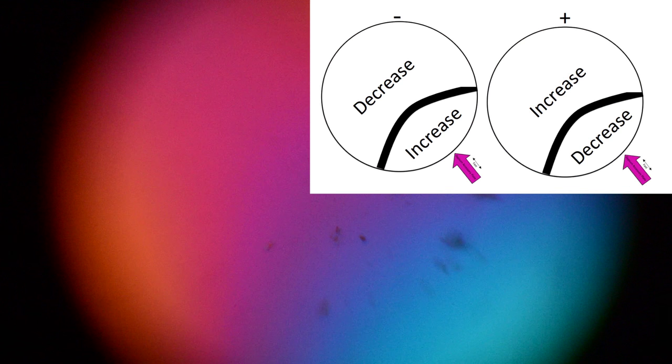What is the optic sign of this mineral? If you said biaxial negative, you are correct. The area under the curve of the isogyre exhibits an increase in interference colors, and the area outside of the curve exhibits less of an increase.